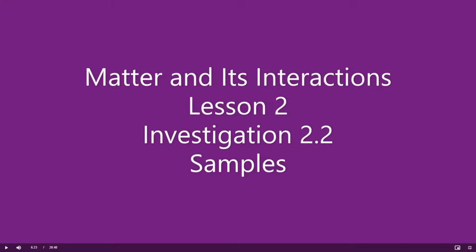Okay, so this is Investigation 2.2 in Lesson 2, Matter and its Interactions. And this is kind of a two-part investigation. At first, we just have to make physical observations of a few powders. Four known powders being table salt, Epsom salt, borax, and citric acid. And then we have a mystery sample that we have to make observations about.